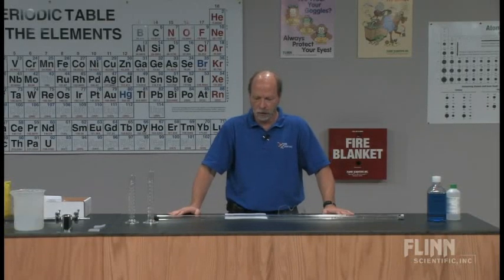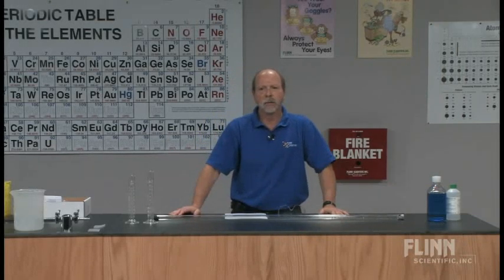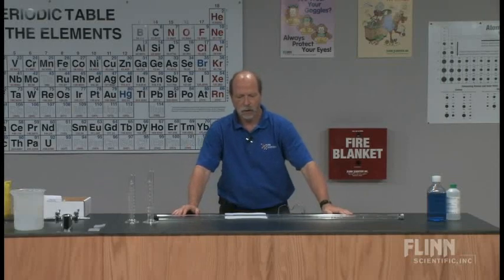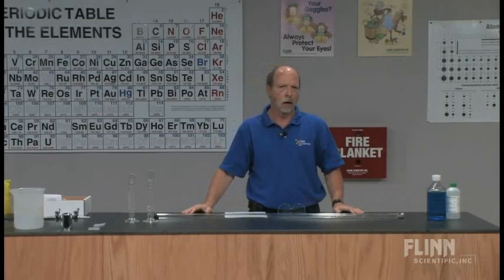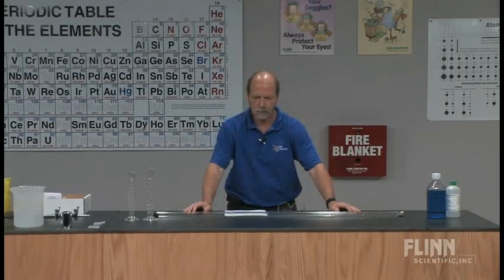This demonstration that I'm going to illustrate shows a relationship of what happens when you add one volume of a substance to another. It's entitled Vanishing Volumes. Many concepts in chemistry are difficult for students, be it first year or beyond, because we have to make mental images of the concepts that we're talking about, because not everything that we're talking about is visible to us.